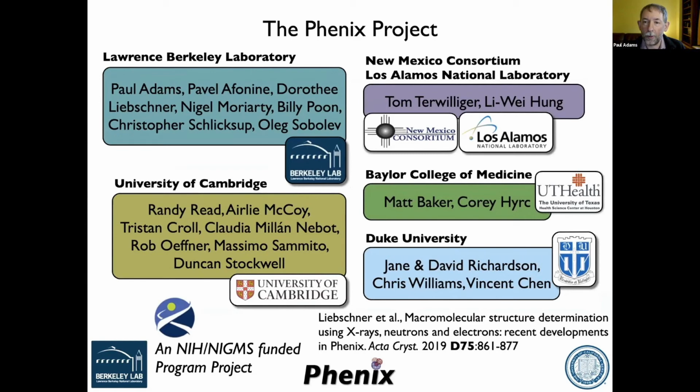Great. I have one question. Yeah, Prince. Yeah. Hi, my question is to Pavel. I think I asked during the chat also, it's something about the weight matrix. First question: the weight matrix in the code we see and the weight option in the refinement, are both the same thing, or totally unrelated?